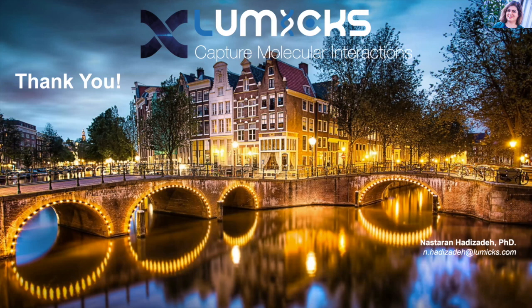Yeah, I think you need to get the statistics. Basically, you need to look at the number of complexes bound, and if you do those kind of bleaching experiments that I showed earlier, you can get an idea of how long it takes, for the specific laser power and imaging settings that you have, for a spot to go away, or bleach. Once you get those time scales, if you see the spot disappearing in a shorter time, you would count it as unbinding. So I hope that answers your question, but you need to get those bleaching time scales first, and you get them by looking at the population of molecules.